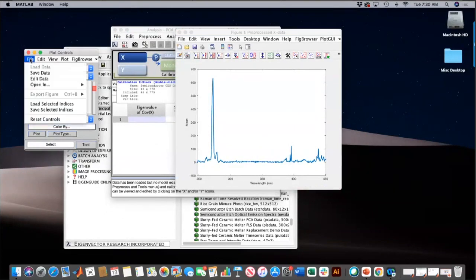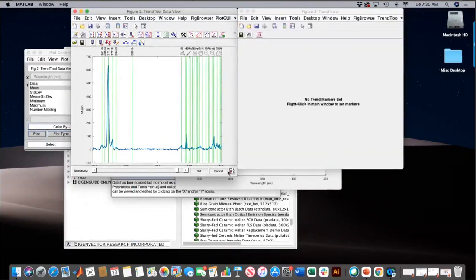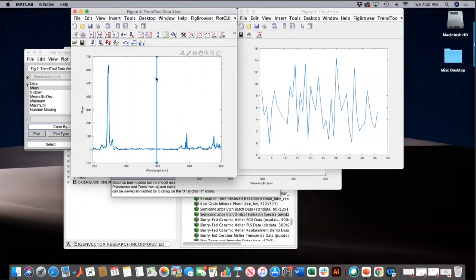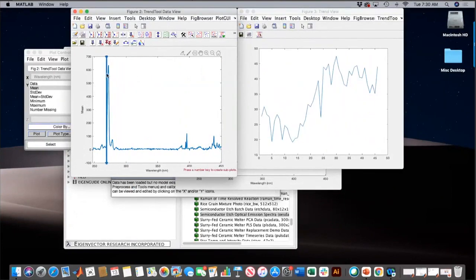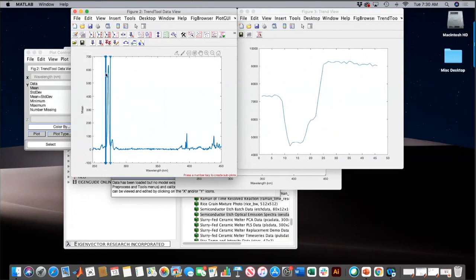Okay. And generate 2 markers, maybe one on the large peak around 270-ish. Okay. Let me cancel that out. And okay. Here, you want me to split this to an area? Or just... You could, that's fine. Okay. Okay, so here I am on the large peak. And now create a marker maybe for that doublet just shy of 400.